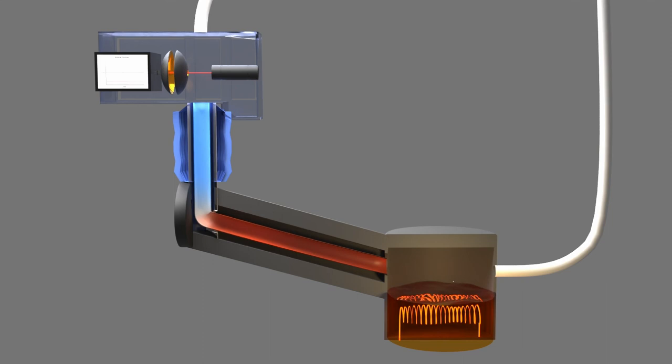Inside the condensation particle counter, or CPC for short, the sampled gas is first drawn through the sample tubing and into the saturation chamber.